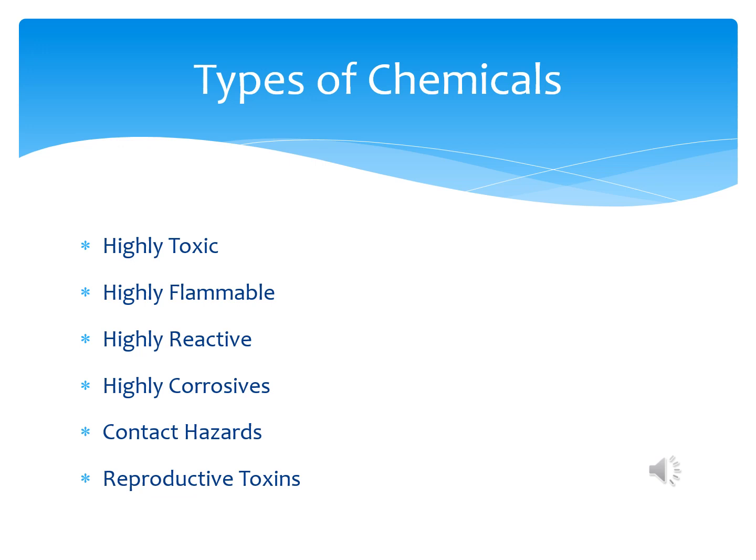A chemical is classified as highly flammable when its flash point is less than 100 degrees Fahrenheit. We have many of these on campus. A few examples are acetone, methanol, cyclohexane, ethanol, and pentane. Highly reactive chemicals usually are reactive with other chemicals or substances, such as hydrogen peroxide and its reactions with metals, or sulfuric acid and its violent reaction with water.